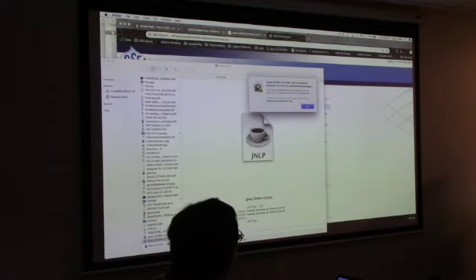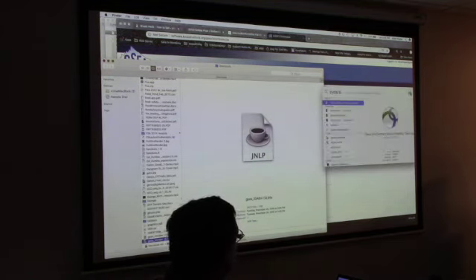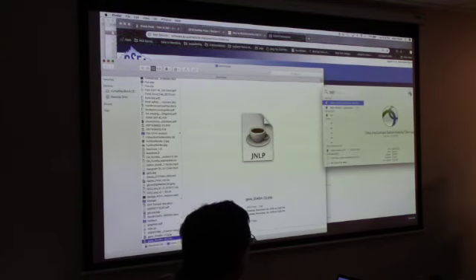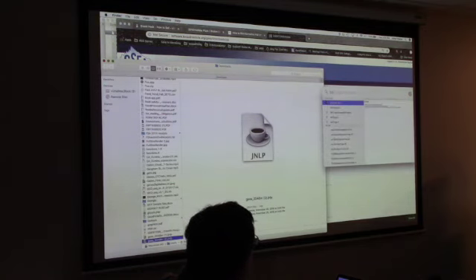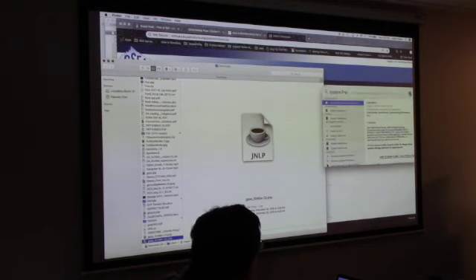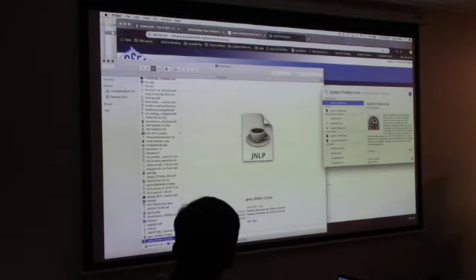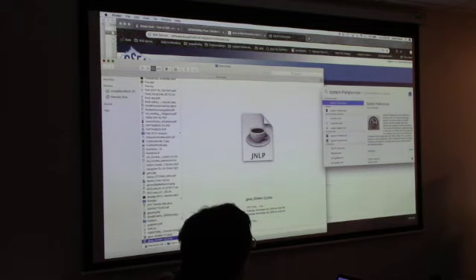Okay, so when it says this kind of thing, what do you have to do? Go to System Preferences. Come on, man. What is it called, settings? Why did they remove that? System Preferences. I thought that's what I said, right? There you go. Alright, something's weird. I'm just going to try to put it in here.